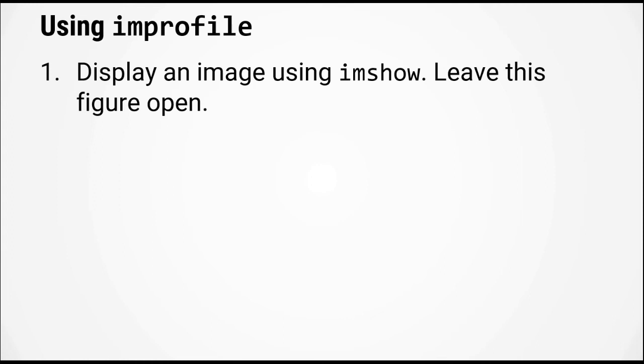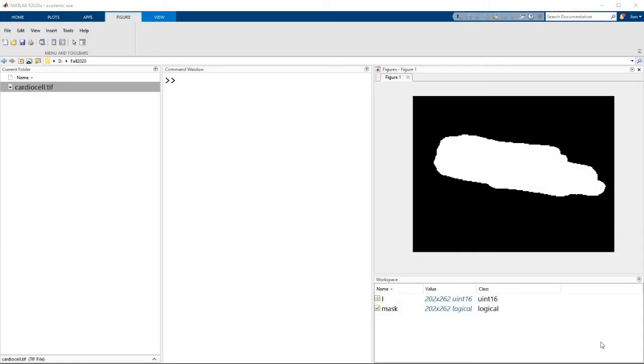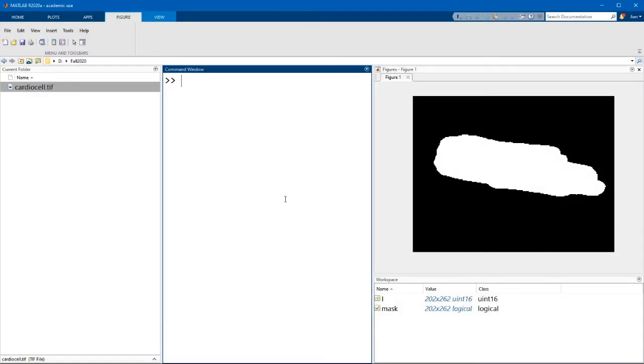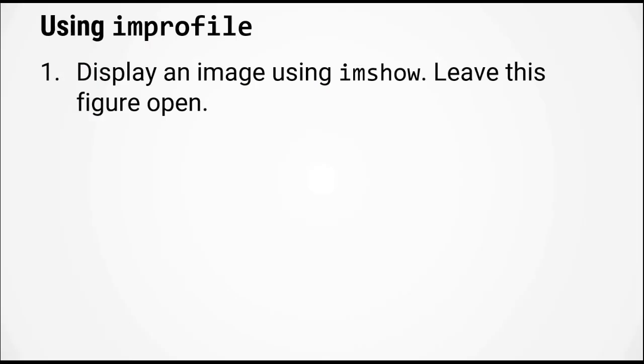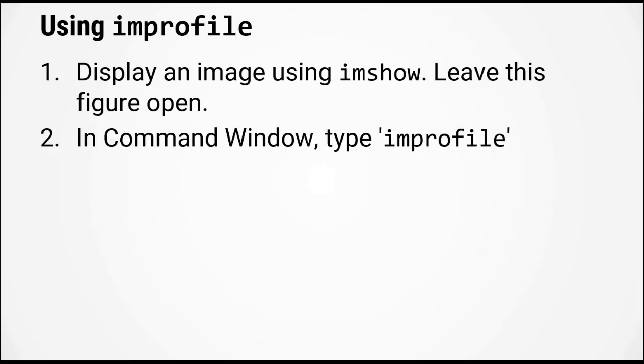Here are the basic steps of using improfile. First, you have to display an image using imshow and you have to leave this figure window open. Step two, in the command window, type in improfile.